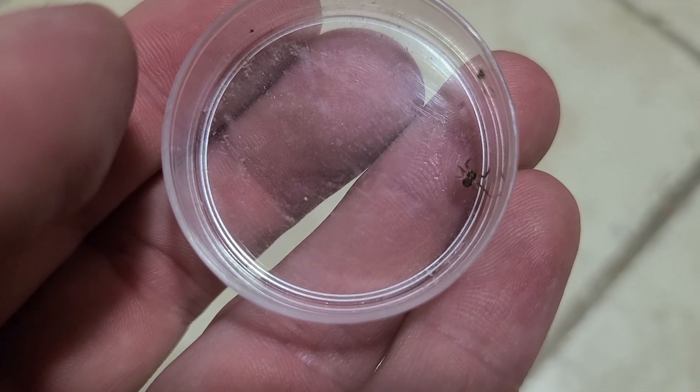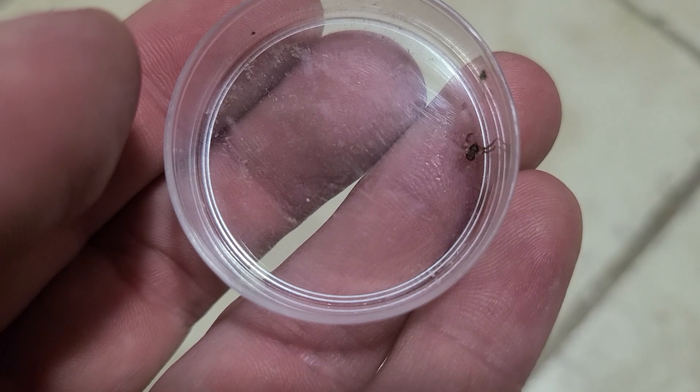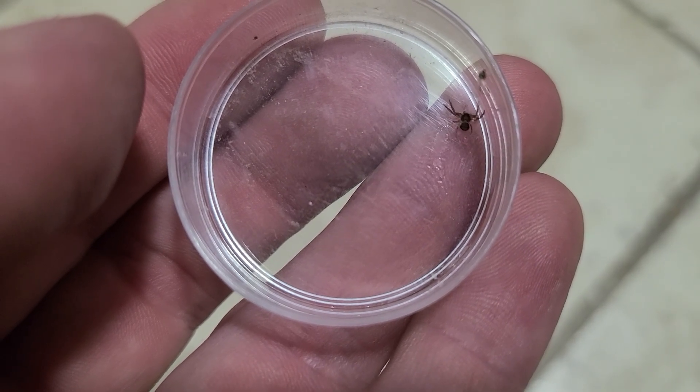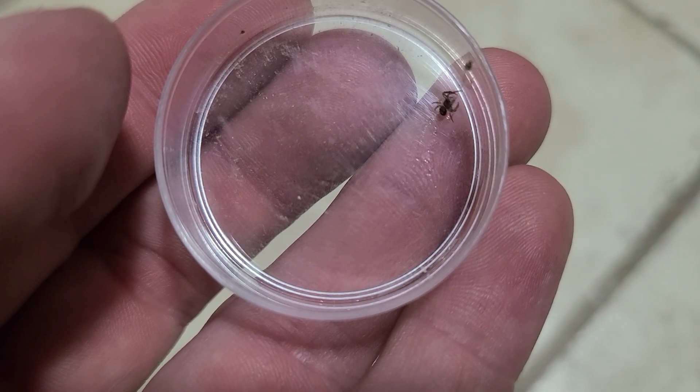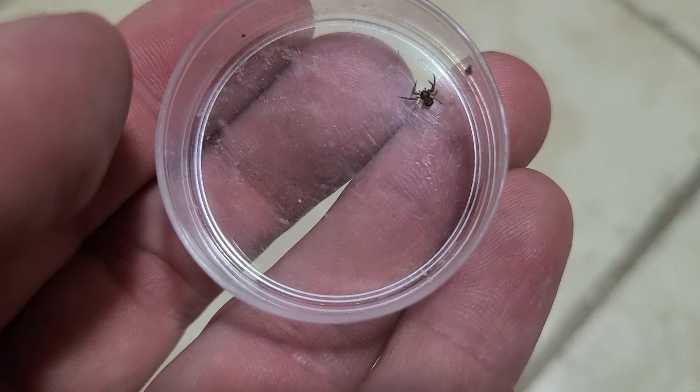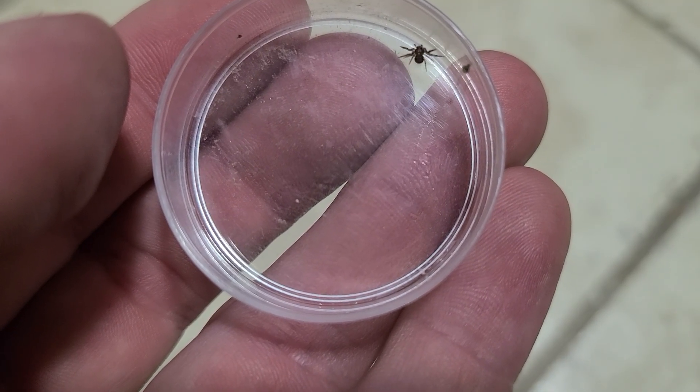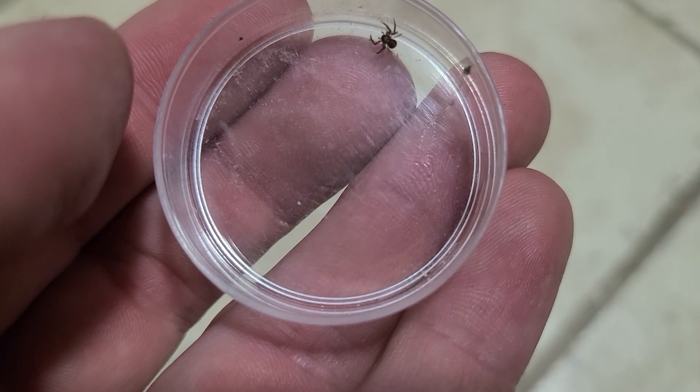They also have a very crab appearance, having their two long legs on each side stretched out and a pincer-like formation. I'll show you what I'm talking about. So let's get it under the microscope and take a look at this guy.